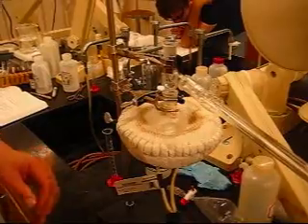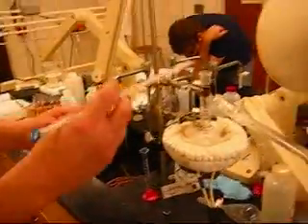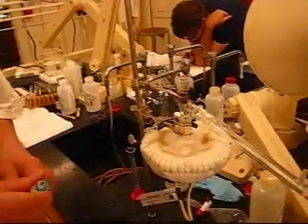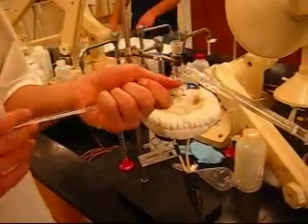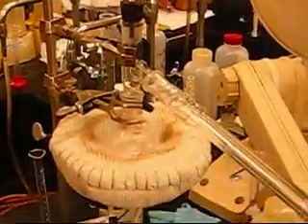And in distillation, what we find is that as our product goes, it's going to leave behind the thing with the higher boiling point. So to know when we're starting to get into the thing with the higher boiling point, we're going to record the temperature. And then we're ready to go.